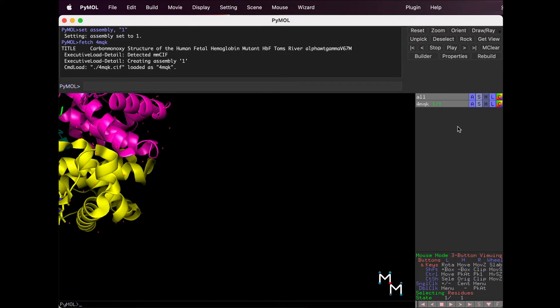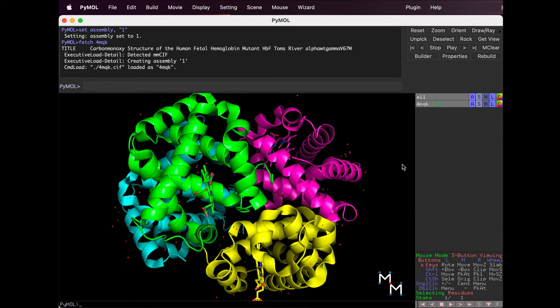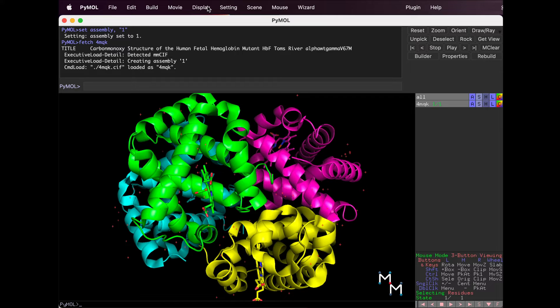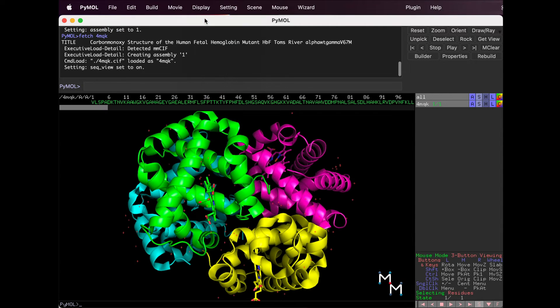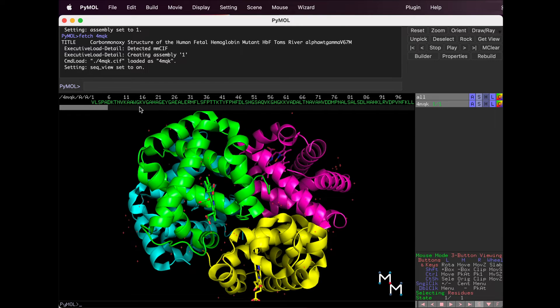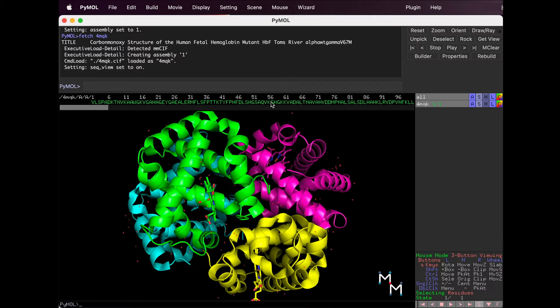The first thing I do after loading a structure is show the sequence. In the drop-down menu, select Display Sequence. The sequence pops up giving the one-letter codes for the amino acids that make up the primary structure of the protein.